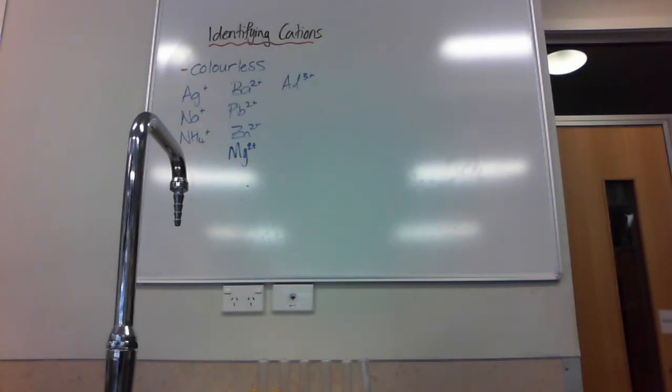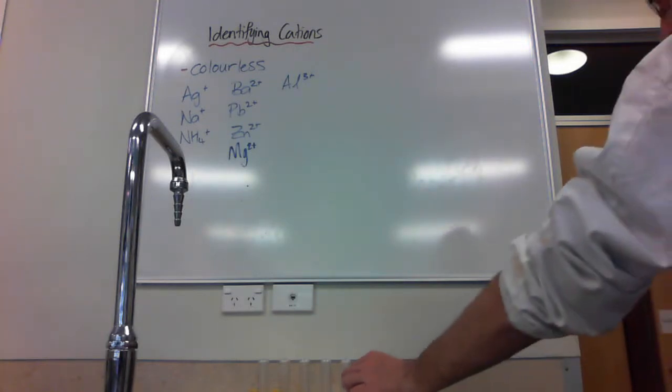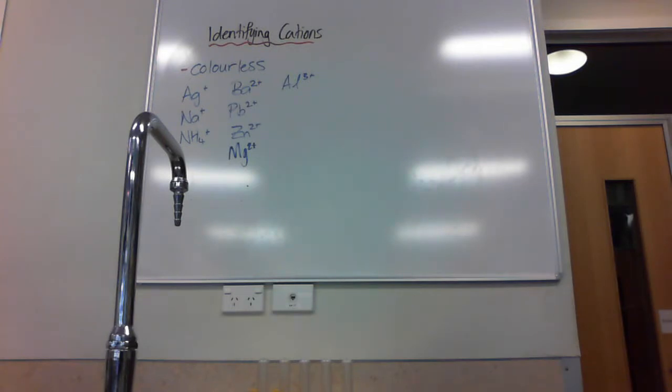In this experiment, we're going to grab one random solution, and we're going to use a flowchart found in Beginning Chemistry by Wignall and Wales, page 47. We're going to use the flowchart in that to try to determine which ion it is, and we're going to write equations for that. So that's what this video is going to be about.